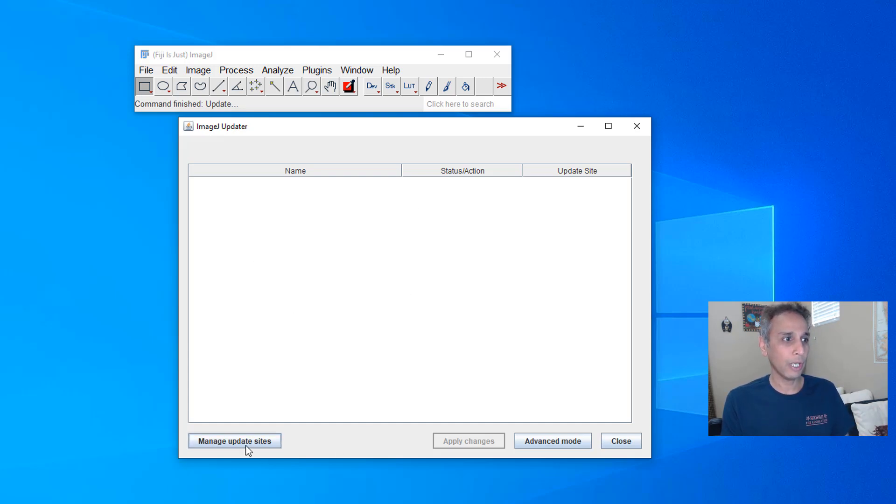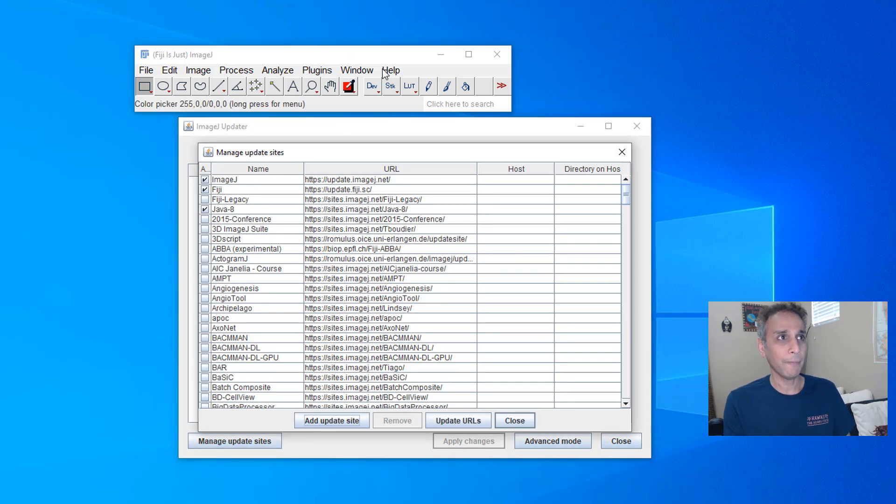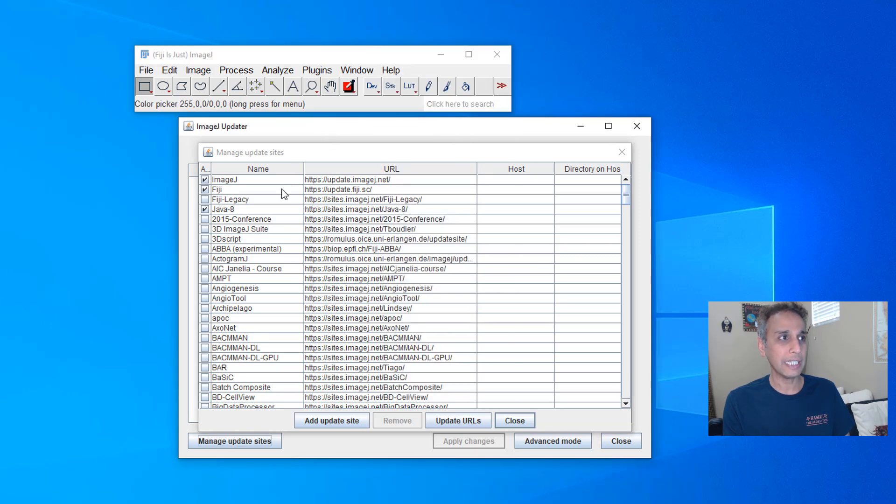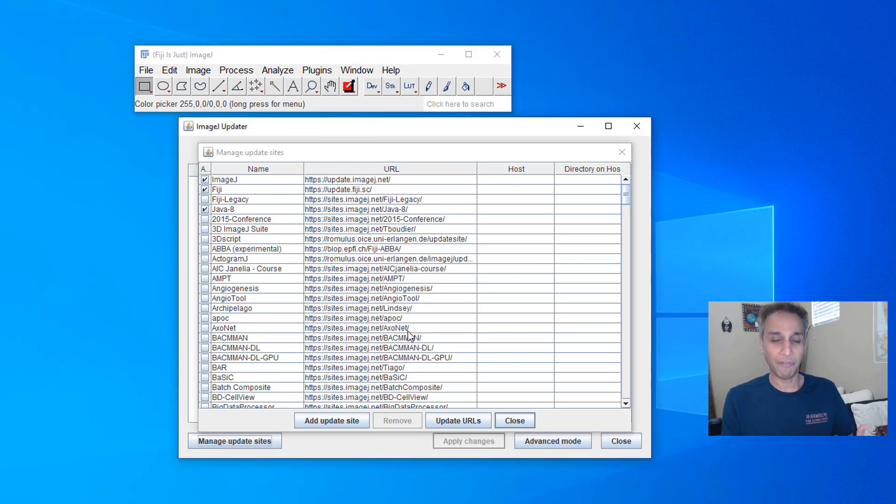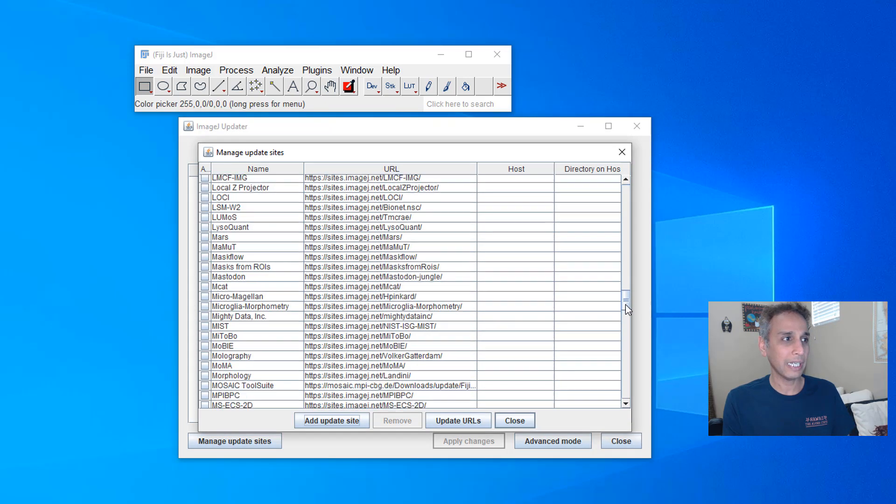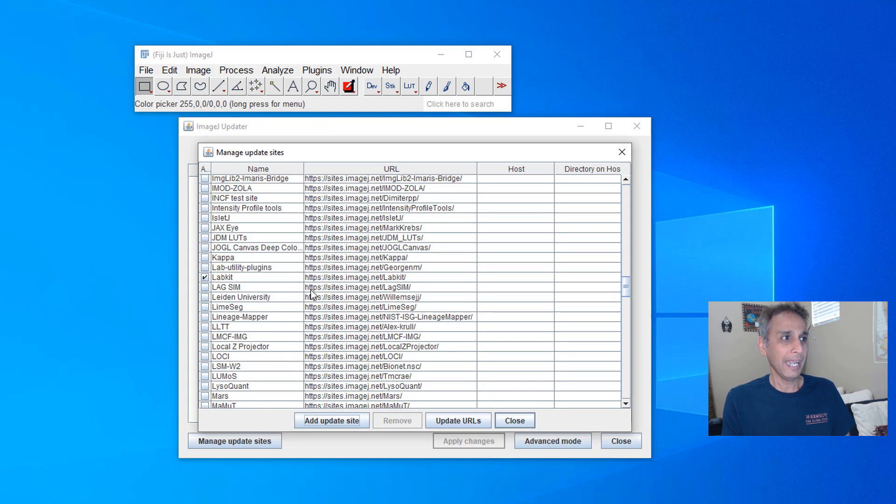So once you see this screen, go down to manage update sites and when you hit this update, it's going to look for these update sites and download whatever plugins are available as part of that update site.